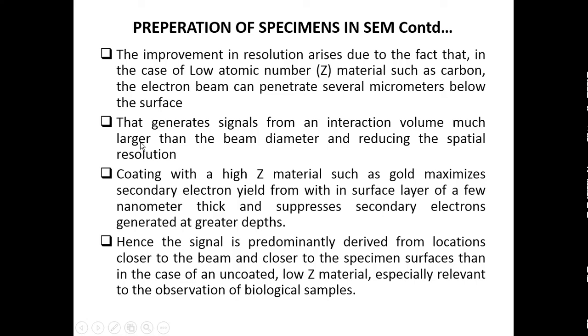So if the beam penetrates several micrometers below the surface of the sample, the interaction volume is much larger than the beam diameter, which reduces the spatial resolution.